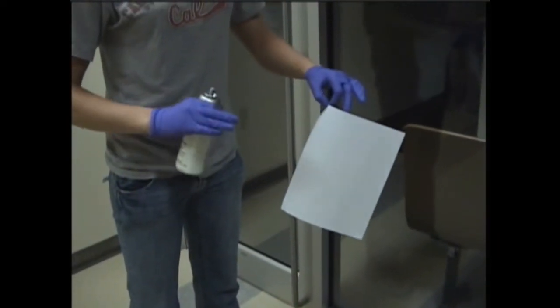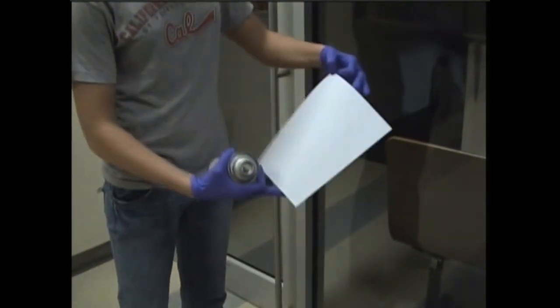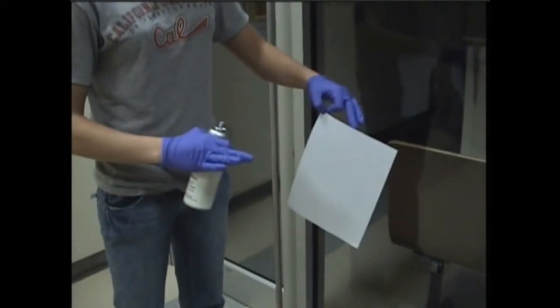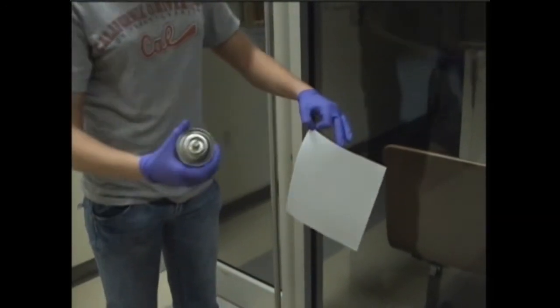Today I'm going to demonstrate how to bring out a latent fingerprint on porous surfaces, such as this piece of paper. We have a handprint on this piece of paper, but you can't see it, of course. In order to bring it out, we use a chemical called ninhydrin. It brings out latent fingerprints on papers, woods, and fabrics.